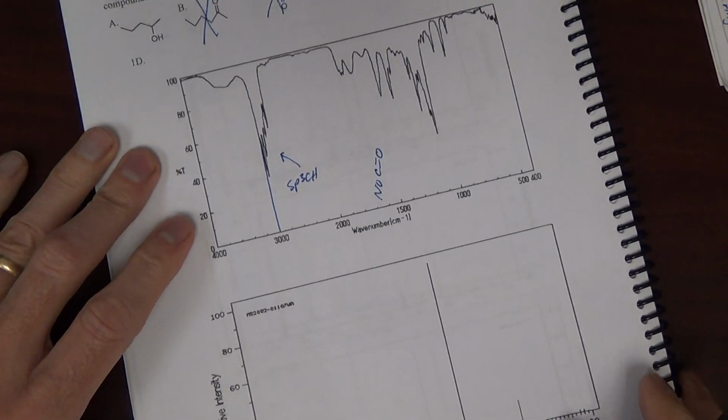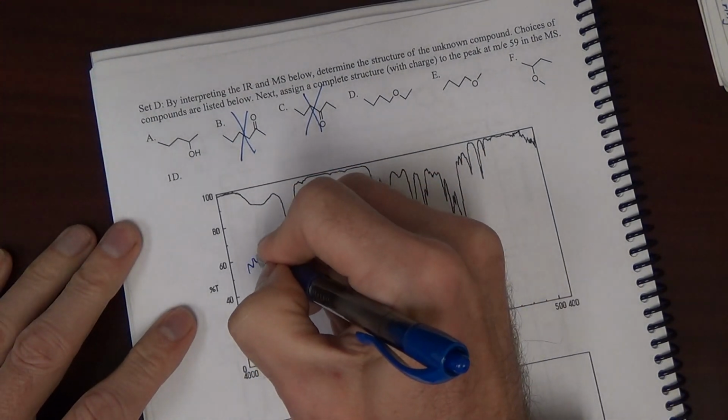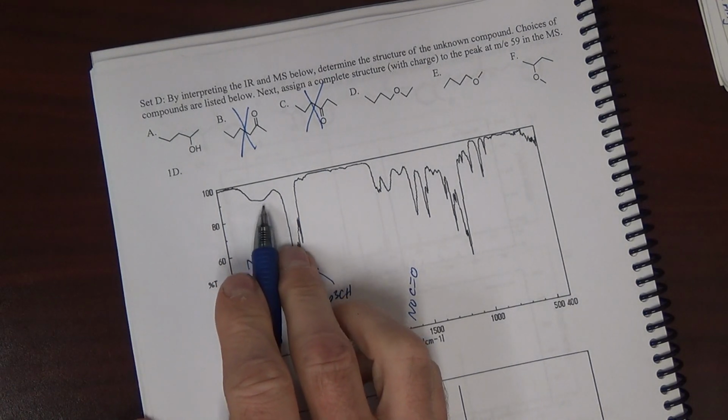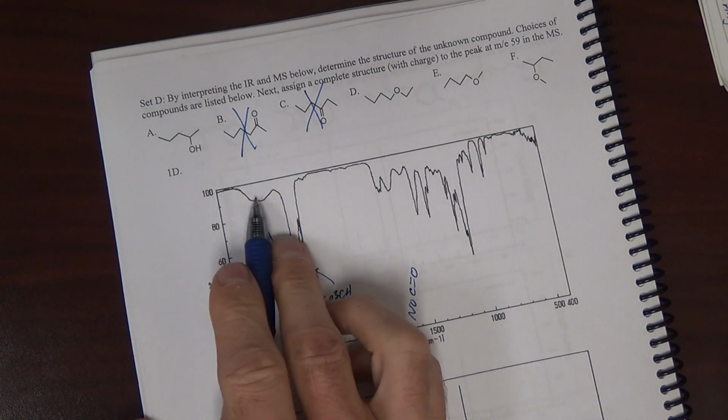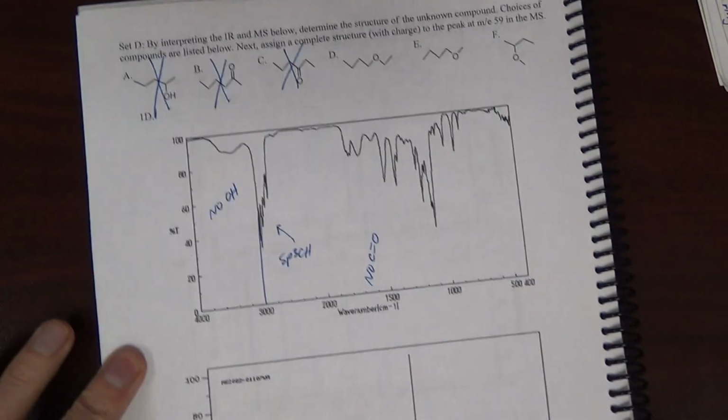I see an alcohol here. I don't see an alcohol in the IR. That's too weak. That might be a little water, but that is certainly not an alcohol. Certainly not a textbook alcohol. No alcohol. I'm thinking we can exclude that there.